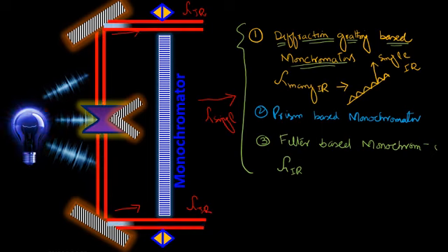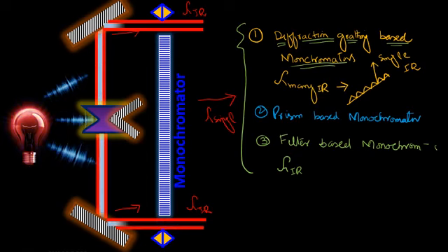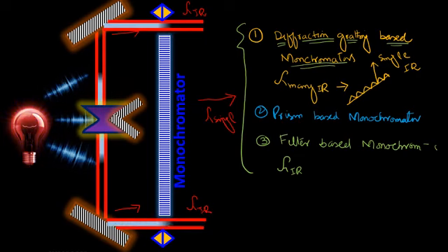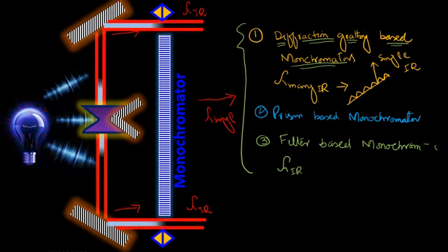So this is the first part, which is known as the IR source region of the spectroscope. The IR source region consists of an IR radiation source, an optical or mechanical chopper, some mirrors for deflection of infrared radiation, and a monochromator, which converts a multi-band IR radiation into a single wavelength of IR radiation.